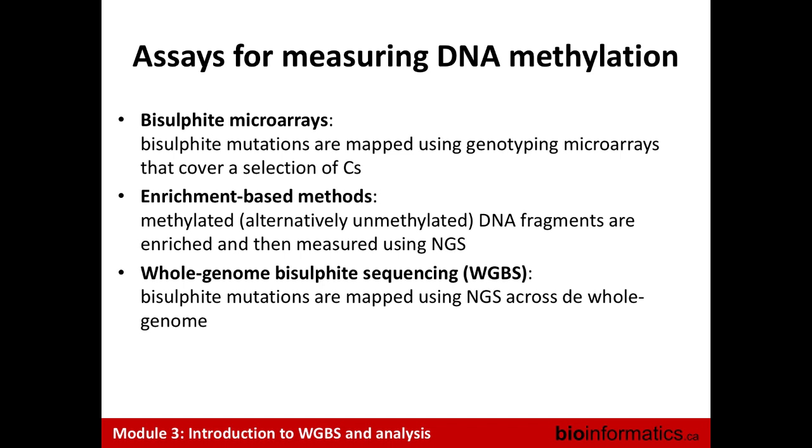But we're here to learn not so much about methylation itself, thankfully, because I wouldn't have been able to go much further than this. We're here to learn how we measure methylation and how we analyze data coming out of that. Standard approach: there are really three broad categories of approaches. You have microarrays, which we're going to cover briefly; enrichment-based methods, so different methods to enrich DNA fragments and then sequence them; and then more whole genome, untargeted approaches with whole genome bisulfite sequencing. So we'll go through that in detail.